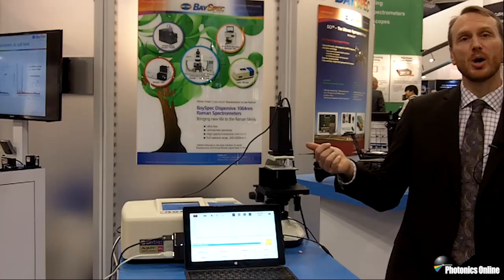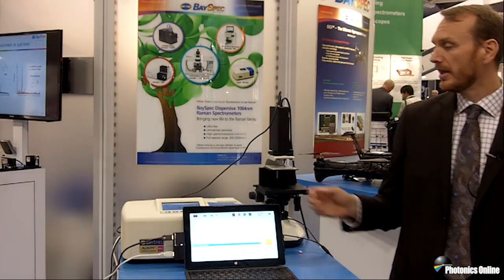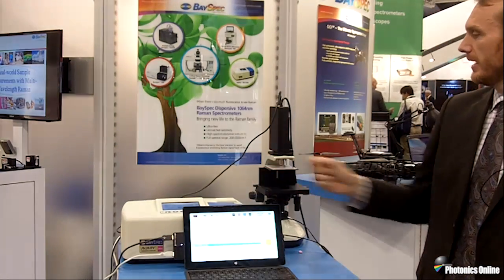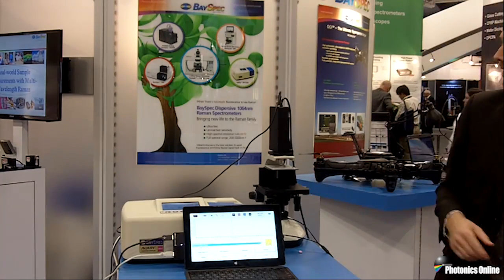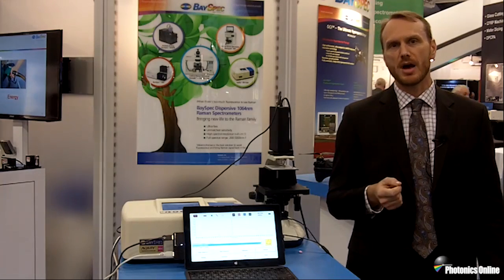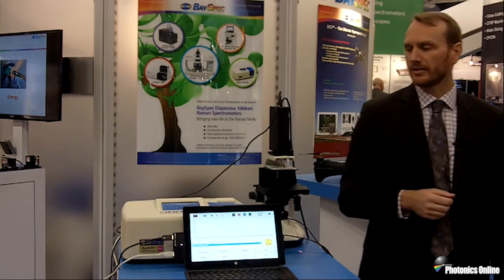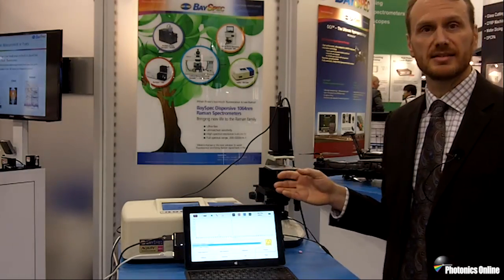This imaging probe is another example of the flexibility that we have with the Agility portable Raman spectrometer. You can direct couple to the system through a fiber port, getting the laser light from the system and then the Raman signal back in. This allows you to focus exactly onto your sample where you want the Raman signal from, to greater enhance the ability to get the Raman signal. In this case, this one is set up for just 1064.